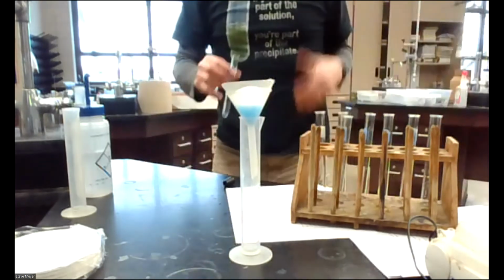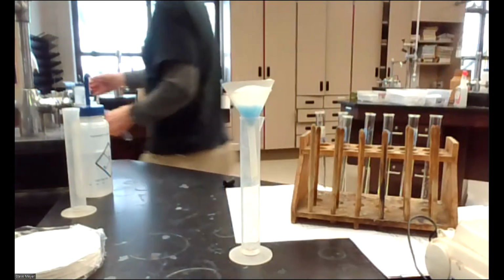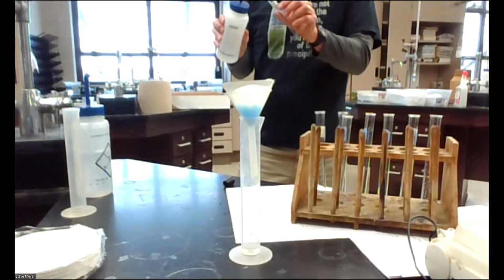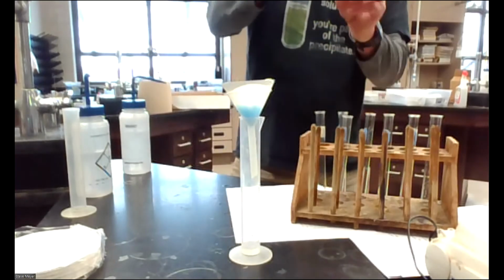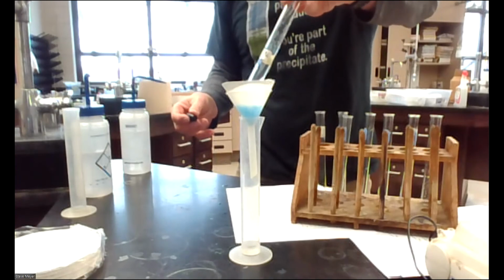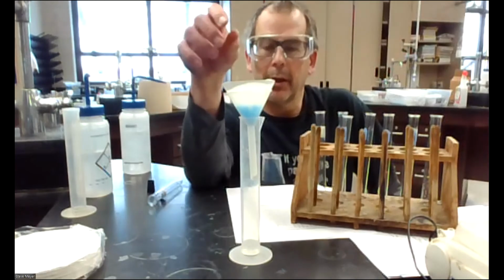I want to use as much water as needed, but I don't want to use too much because it'll take longer to filter. So I'm going to grab a little distilled water bottle, teeny residue right here. I don't have much, but a little bit extra in there, shake it around, and then I'm going to dump this leftover in here. Okay, and I'm just going to let it drip, drip, drip until it's done.